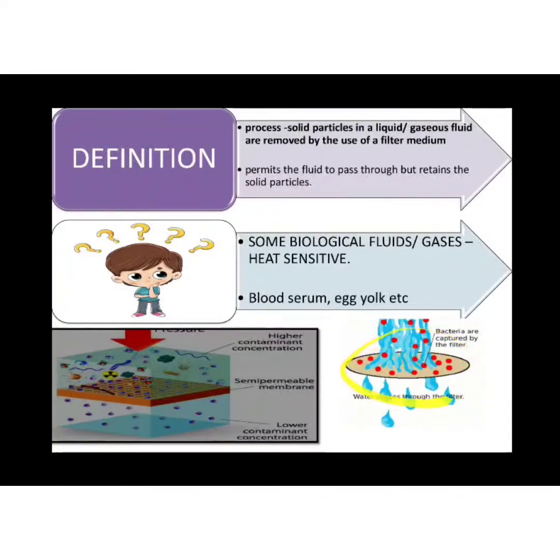As you see here in this picture, there is a solution which contains solid materials as well as liquid material. This is the filter pad. The solution is passed through the filter pad of one particular pore size. Only the liquid portion gets collected, which is called the filtrate, and the solid particles get absorbed or collected on the filter pad, because the size of this material will be bigger than the pore size. Here solid particles means the microorganisms which get separated out.